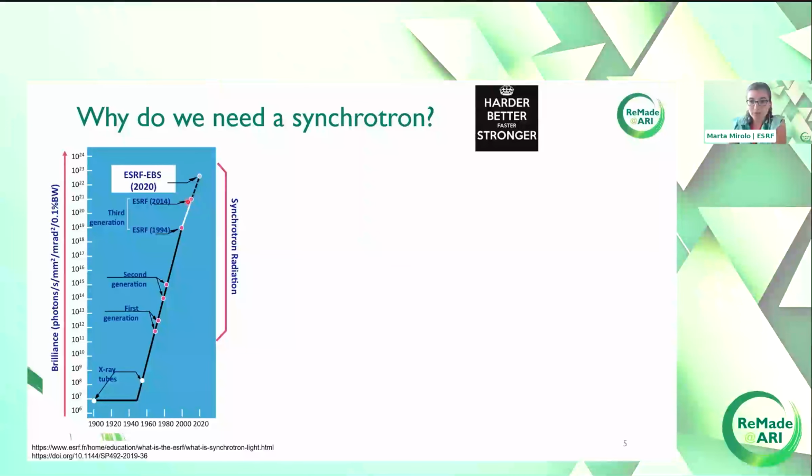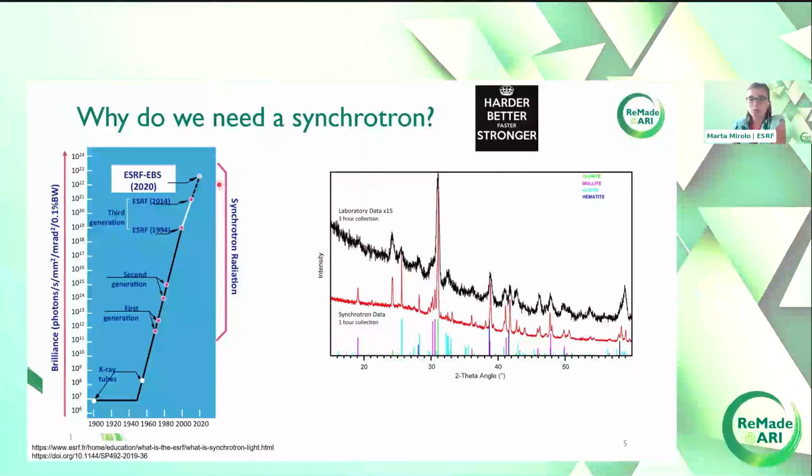Third generation synchrotrons are very common. Now we are seeing upgrades. The first one was MAX IV, to become the fourth generation synchrotron. The ESRF was recently upgraded to the first high energy fourth generation synchrotron, and other synchrotrons are following. So we are gaining in brilliance, which allows us to see things better, basically.